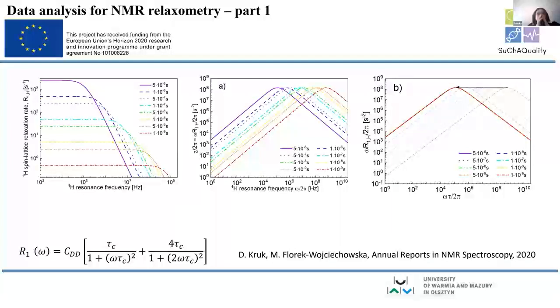The point is that, okay, if it is so, if you get your experimental data, you play the trick, you multiply the relaxation data with omega, and you try to make this overlapping, and it works, it means that indeed it is so. However, I would never see this as an assumption, because this concept assumes that the mechanism of motion does not change with temperature, only the time scale.